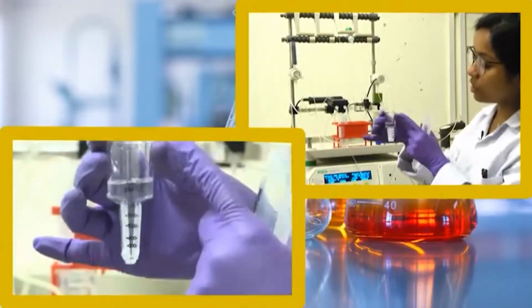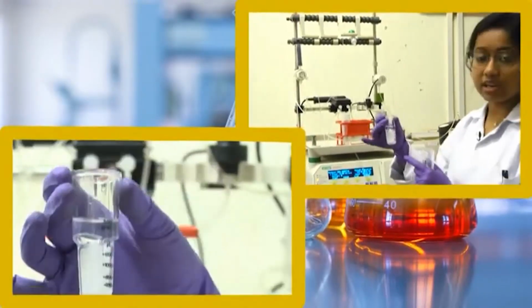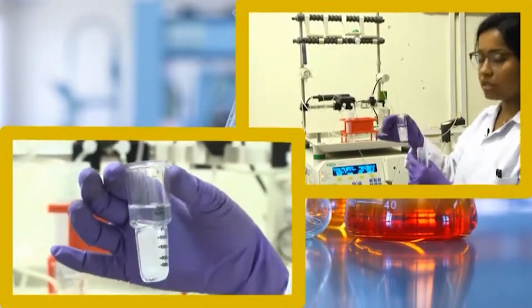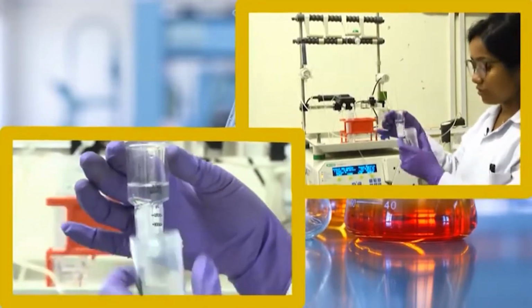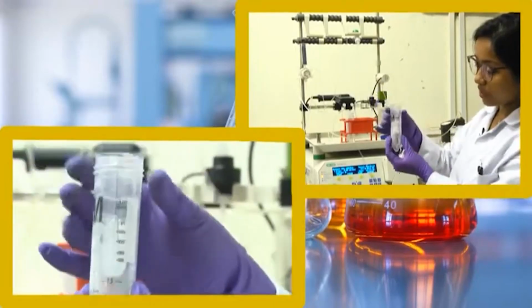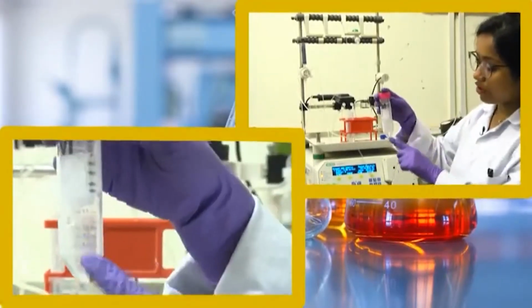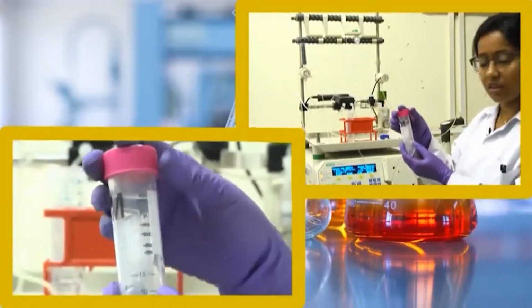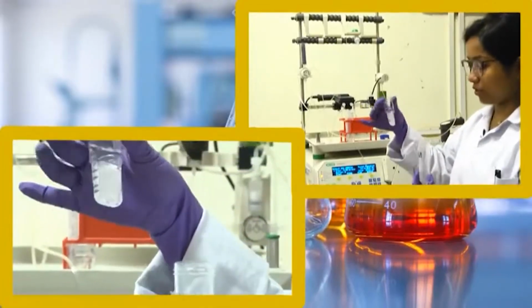So basically you pour your sample into this particular holder, and then while you do centrifugation, through the centrifugal force the other small molecules will come out, so the buffer will also come out and it will be stored in this particular Falcon. So it goes like this. When you rotate the sample, it will come out and be stored here. As my protein is around 15 kilodalton, it will remain inside this particular holder.